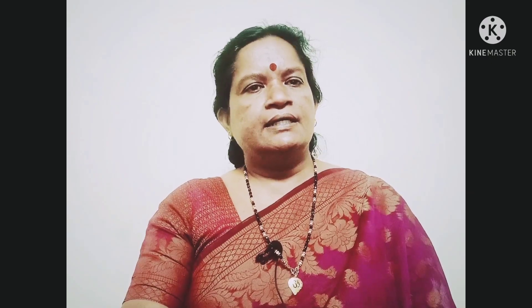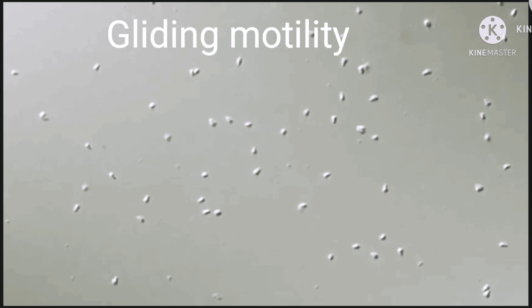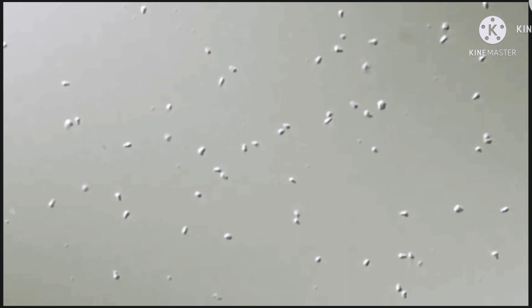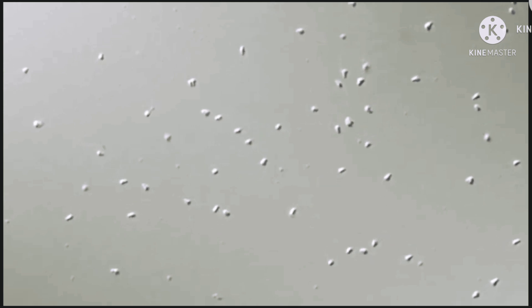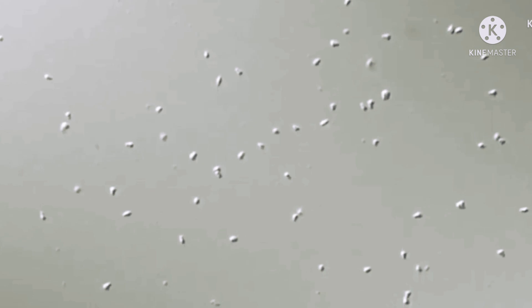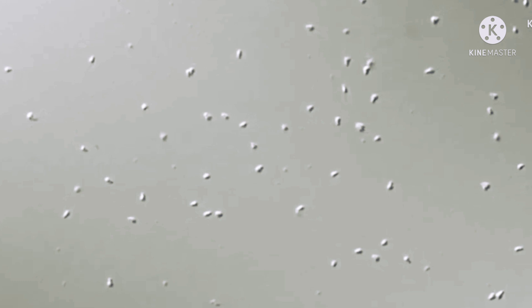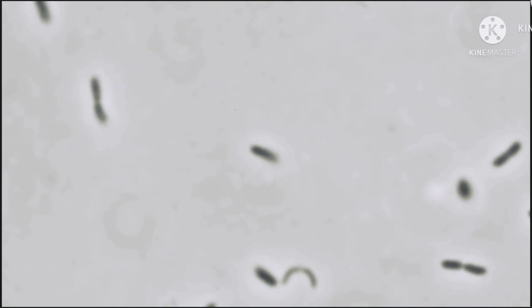Next is gliding motility — as mentioned earlier, it is not true motility but a gentle passive movement usually shown by Mycoplasma, Cyanobacteria, Myxococcus xanthus, and Cytophaga. The bacteria secretes slime and slides on it — you can see them moving gently like gliders in the sky. Next we have spinning motility, shown by Fusobacterium gyrans — if you watch for some time, you will see the bacteria spinning at a very high speed.